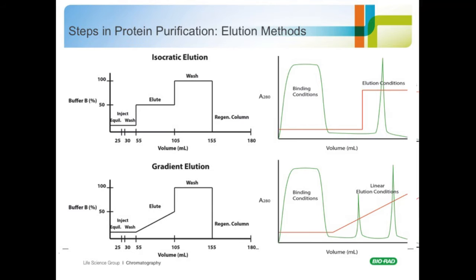One thing I should also point out, you see there are some other steps in this purification protocol listed, and maybe I'll just spend a moment to describe what's happening here. So on the far left, focus your attention on the top left illustration, you see something called equilibration. So this means essentially making sure that the conditions in your sample and the conditions in the column are the same in terms of salt concentration, pH, etc. When we're sure that everything is the same, then we will actually apply our sample to that column. We'll wash. So what we mean when we're washing is we're washing away any unbound or nonspecific binding.